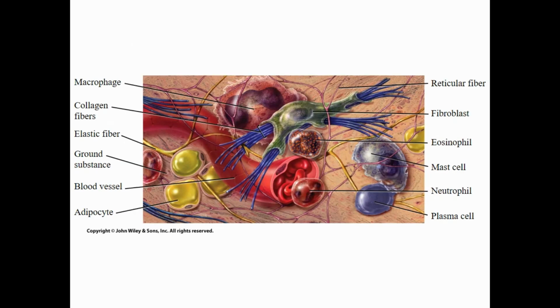All right, so here's that general overview of connective tissue. This is really no particular kind. It just is a generalized view because it has everything. So it contains the fibroblast, which is the cell making all the fibers. You have white blood cells. You have the macrophage. You have collagen fibers, elastic fibers, the ground substance. Remember, that's the stuff that is the extracellular matrix. So that is, remember my analogy from the other day, the peanut butter in the crunchy peanut butter analogy.